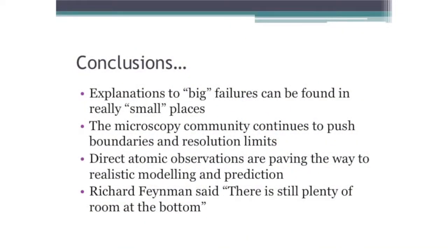I work with the electron microscopy community and with other similar high-resolution techniques, and this is a very dynamic community. When I started working on this 15 years ago, we could only see things as small as 1 nanometer. Now we can see things as small as 50 picometers, which is almost 20 times better, and this is just 15 years, right? And we are still advancing. So what we can see today would be nothing compared to what you might be able to see if you work in this area.